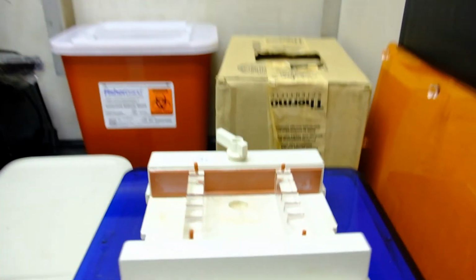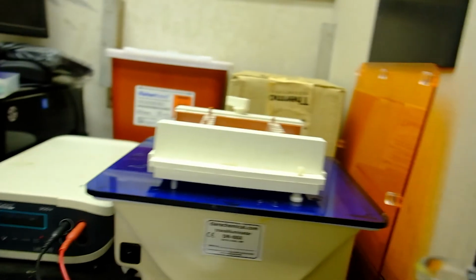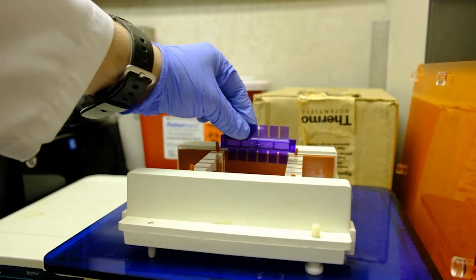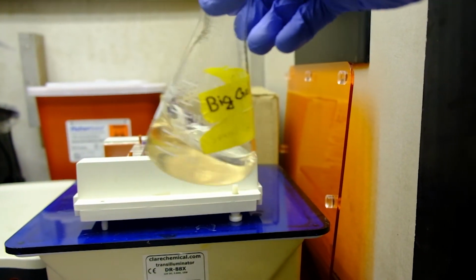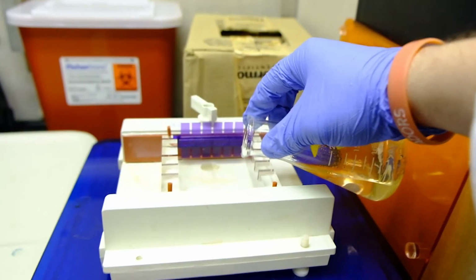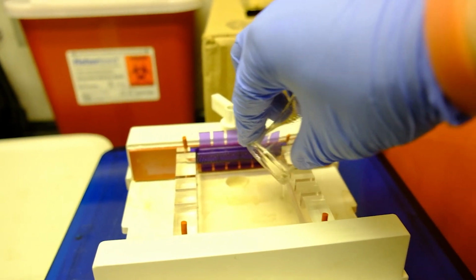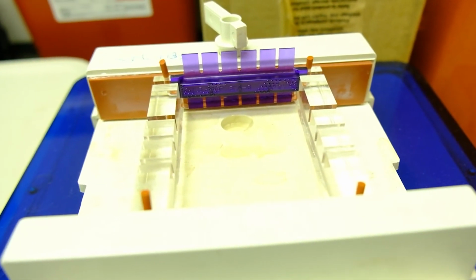Prepare a cast for your gel. This is actually what determined the volume of TAE buffer that we needed previously. Equip it with a comb, it will shape your loading wells. Then get your agarose, swirl it a bit, and gently pour it in the cast, making sure to avoid any bubbles. And let the gel rest until it fully solidifies.